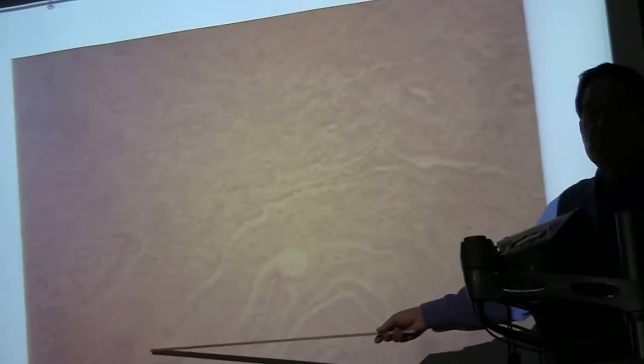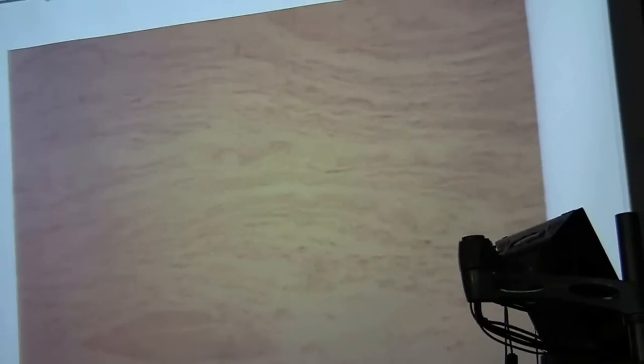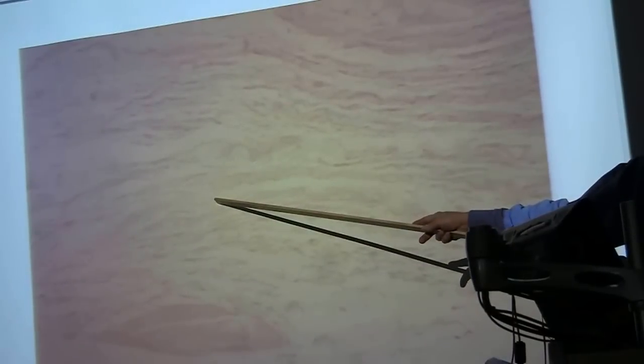You can see it here. It's all lamina propria, over to the edge. Then when you get down here, the tissue starts to become wavy. This is smooth muscle. You can just call it smooth muscle. Then on the very outside, you've got the connective tissue of the adventitia, which supports the organ. So this is adventitia.